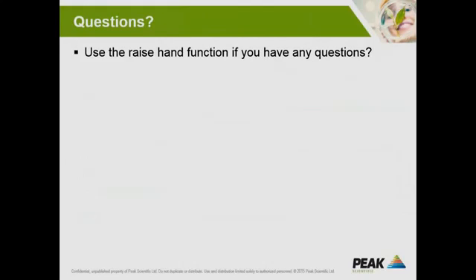For detectors, we would not normally recommend the use of any traps, and particularly for zero air or makeup gas, it's not normally required to use traps. But for carrier gas, I would definitely err on the side of caution and use traps.